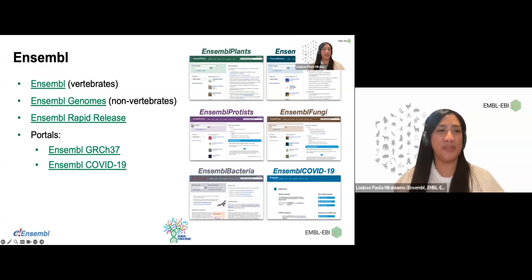One thing I forgot to mention here, the Ensembl Rapid Release website. In comparison to the Ensembl main and genome site, the data there is much more lightweight, as we are updating it quite quickly back to back.